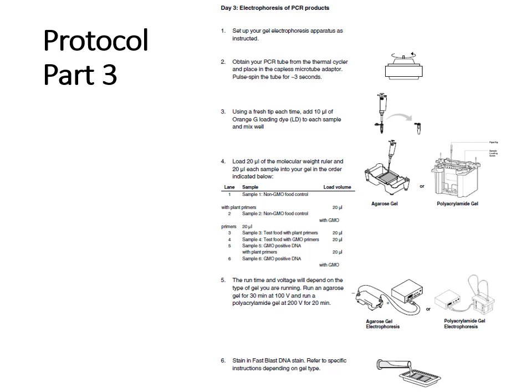And that would bring us to the last part of our experiment, which would have been gel electrophoresis. So you would have to do 3 parts to this experiment. The first part was isolating DNA from test samples from food. The second part would be PCR, setting up a PCR. And the third part would be running the PCR samples, the final products, on a DNA gel, an agarose gel, and looking to analyze the bands that we just discussed in the previous slides.